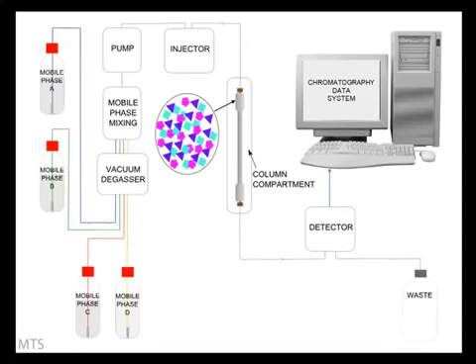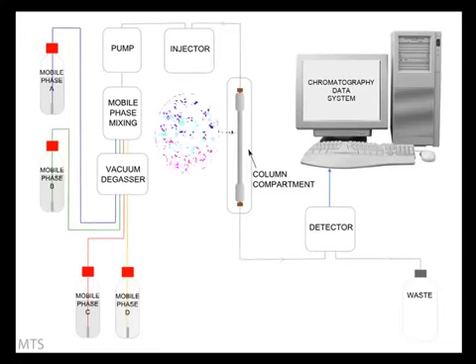in the mixture. In our mixture, the pink component spends more time in the mobile phase relative to the green and the blue and travels through the column quickest. The blue component, however, spends more time on the stationary phase relative to the other 2 and travels through the column slowest. As the mixture passes through the column, they become more and more separated.